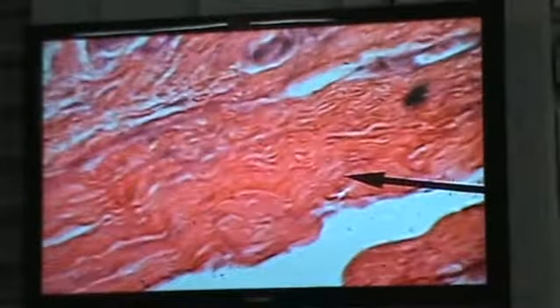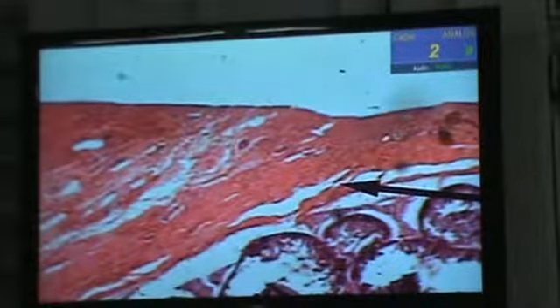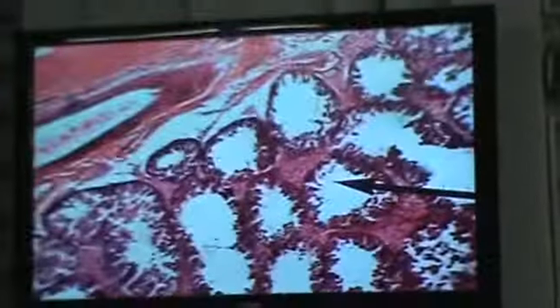Okay. Now, deep to the tunica albuginea, we see in some places we can see better than others, that they are known as the tunica vasculosa. Okay. So there we're back on the testis here. You can see how thick. Look at that. So this is very, very thick. This is in the region going into the mediastinum testis.